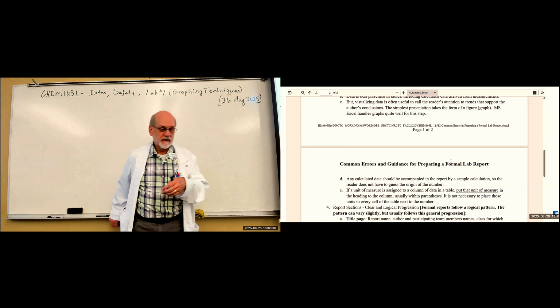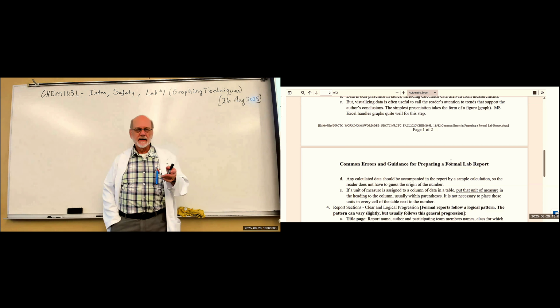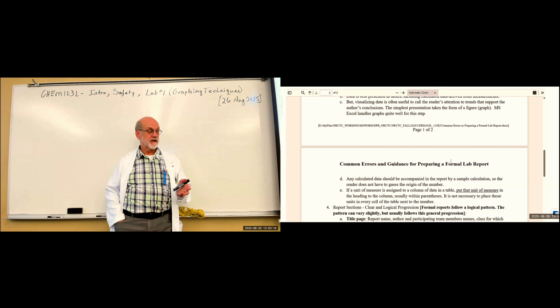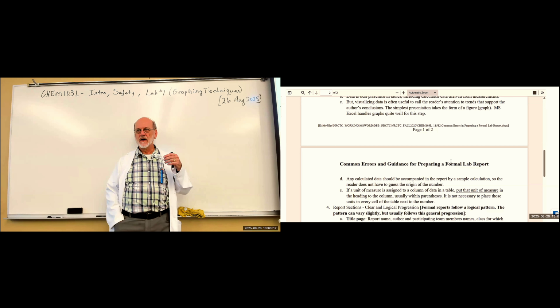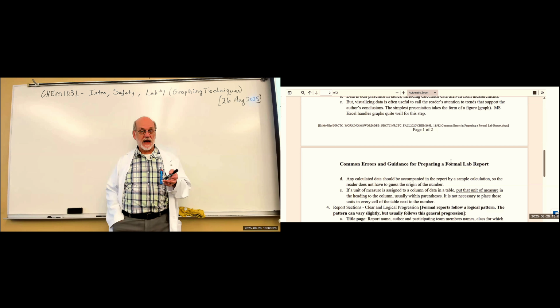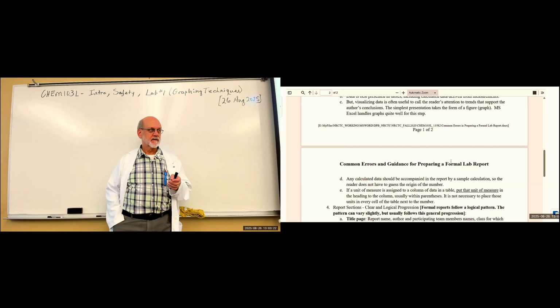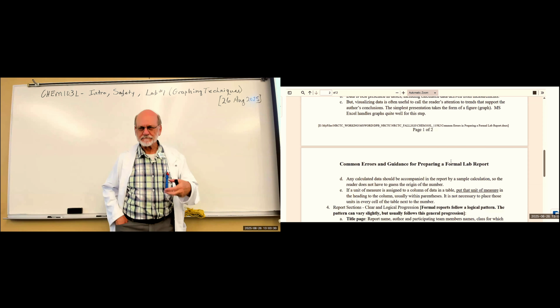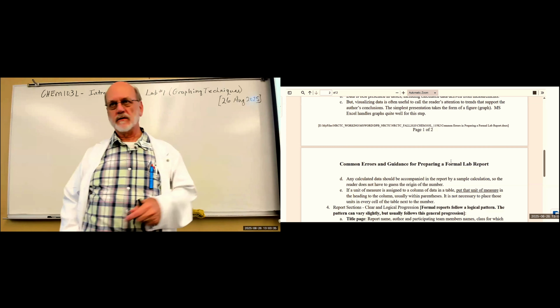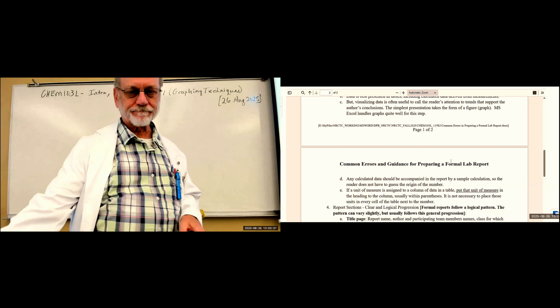And my general rule is, if you have equipment that will measure to 4 decimal places of a gram, and the procedure says weigh to 3 decimal places plus or minus 1,000th, I take as many decimals as I can get, because you can always throw decimals out later, but you can't create them. That's called cheating. So whatever your instruments will give you, keep all those values. Okay.